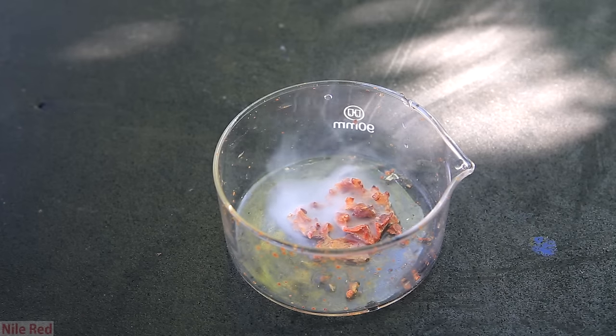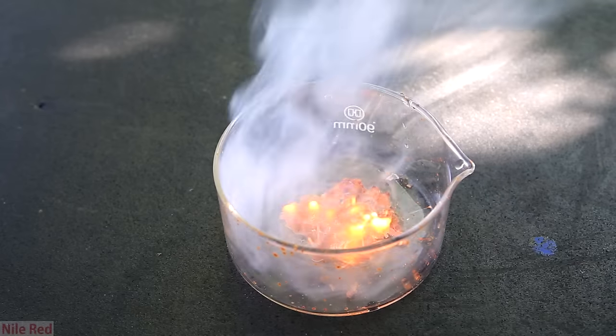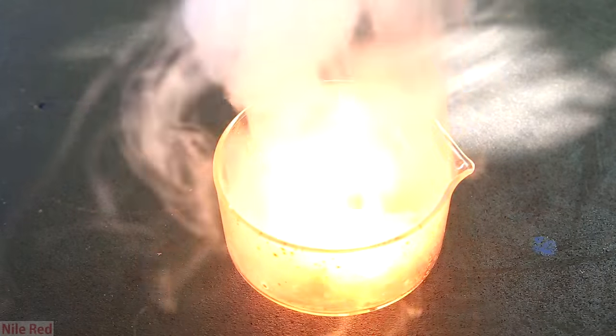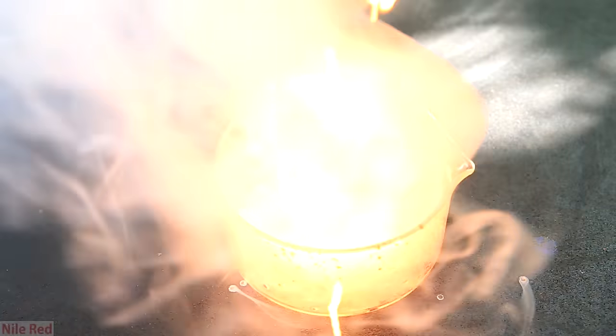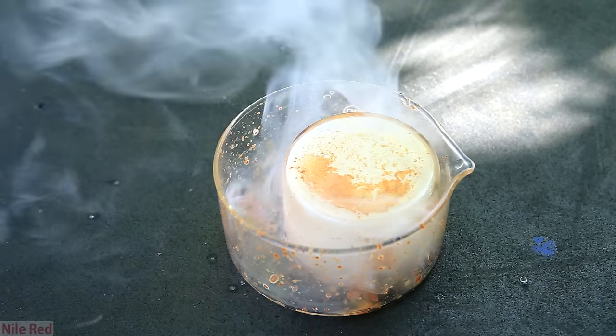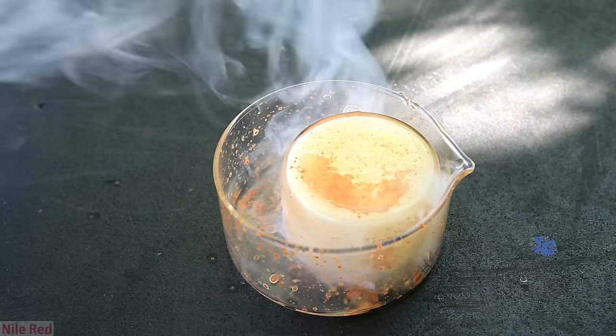Eventually it will heat up enough to spontaneously ignite itself. So you can see what makes white phosphorus so scary. If you get it on you, you can't just extinguish it — you actually have to completely get rid of it. And the phosphorus is poisonous, so even when it's extinguished, it's still going to be leaching into your body.